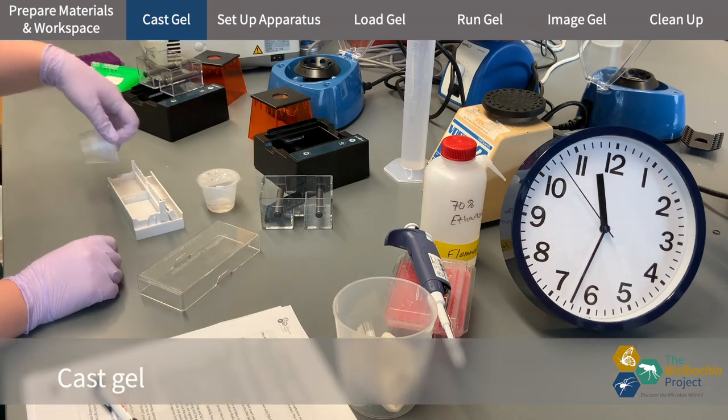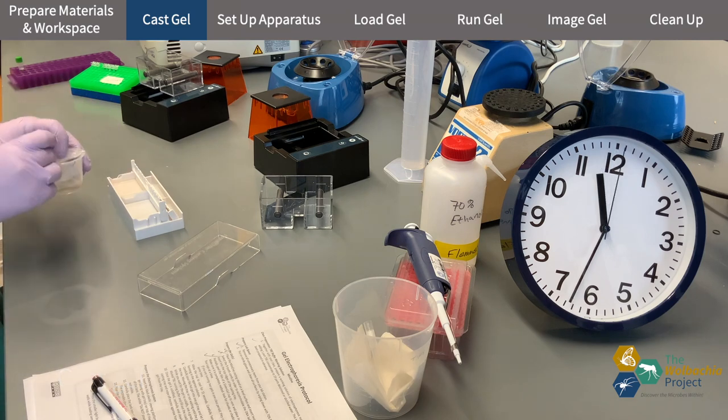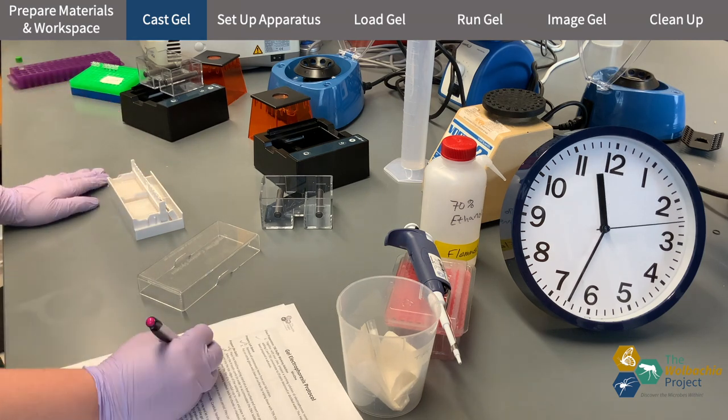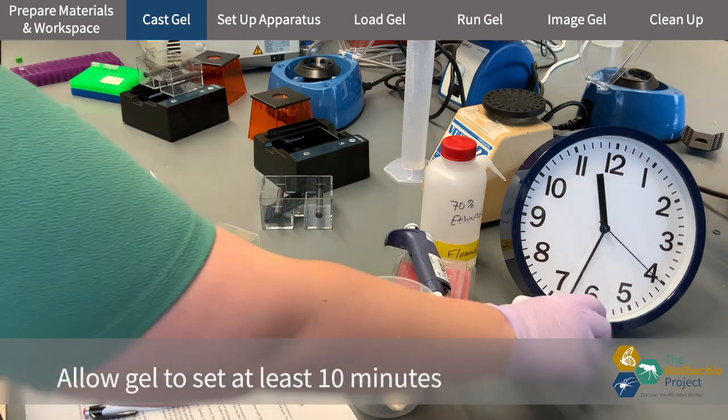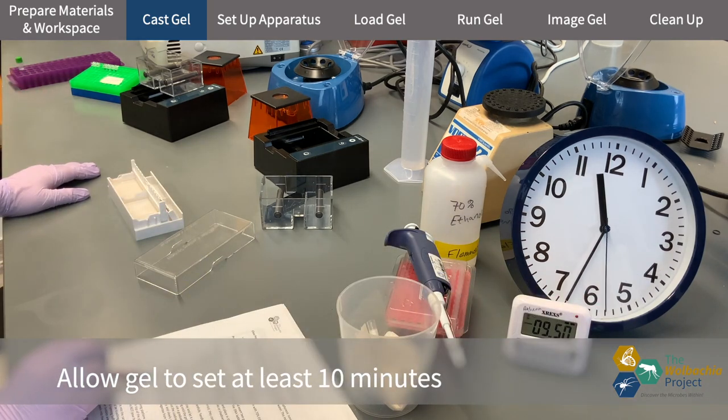It's really important the gel solidifies completely. With gels this small it should only take about 10 minutes so I'm taking the time to wait the entire 10 minutes to make sure that I have a well-set gel.